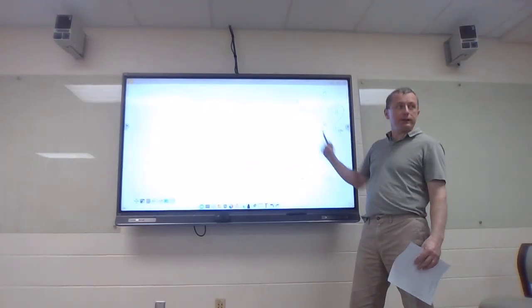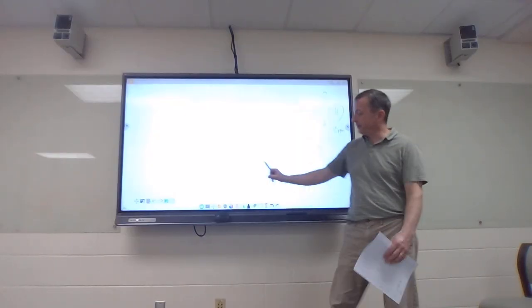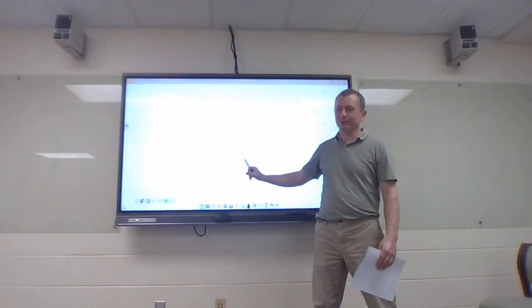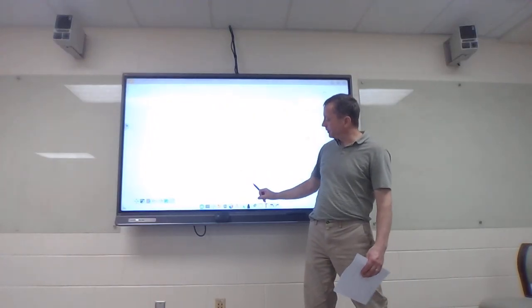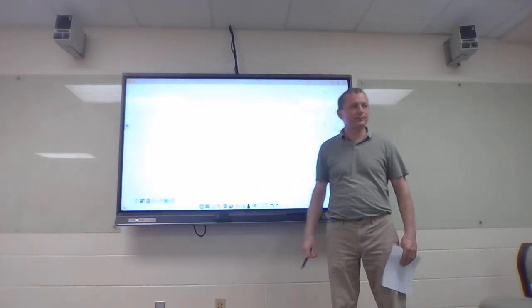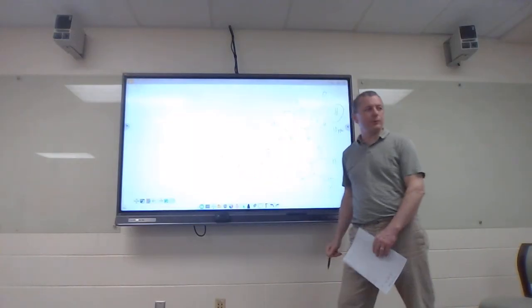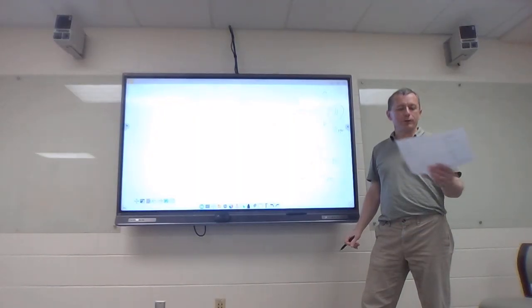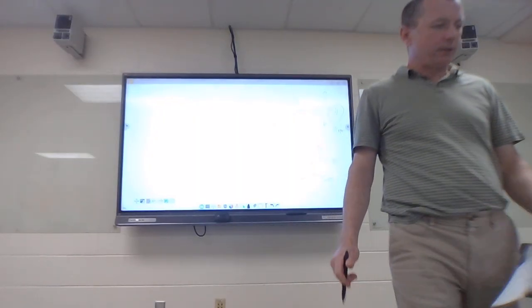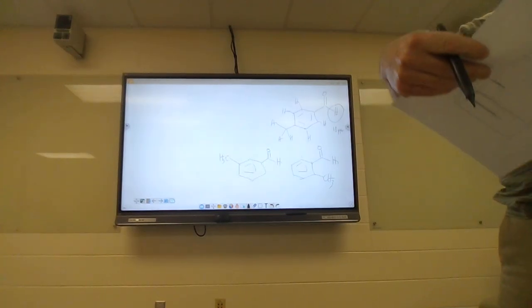Here I'm going to see 2 peaks because of the symmetry. Here I would expect to see 4 peaks. Here, also 4 peaks. Definitely 4 peaks. This one down here is all by itself anyways. These two definitely would not be the same. All right. So I wanted to give you an example of a good aromatic ring in there as well. Let me show you maybe, what do I got time for?